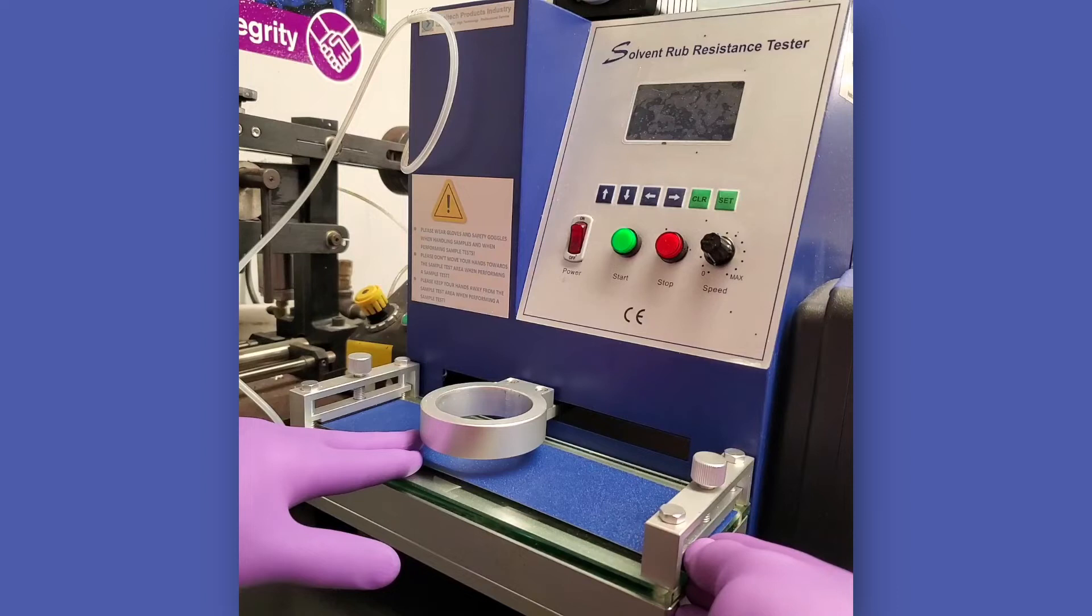The long dimension must be parallel to the rolling or longitudinal direction of the coil for coil coatings. It is imperative that the sample be flat without any high or low points in the panel testing area since this could result in false outcomes.